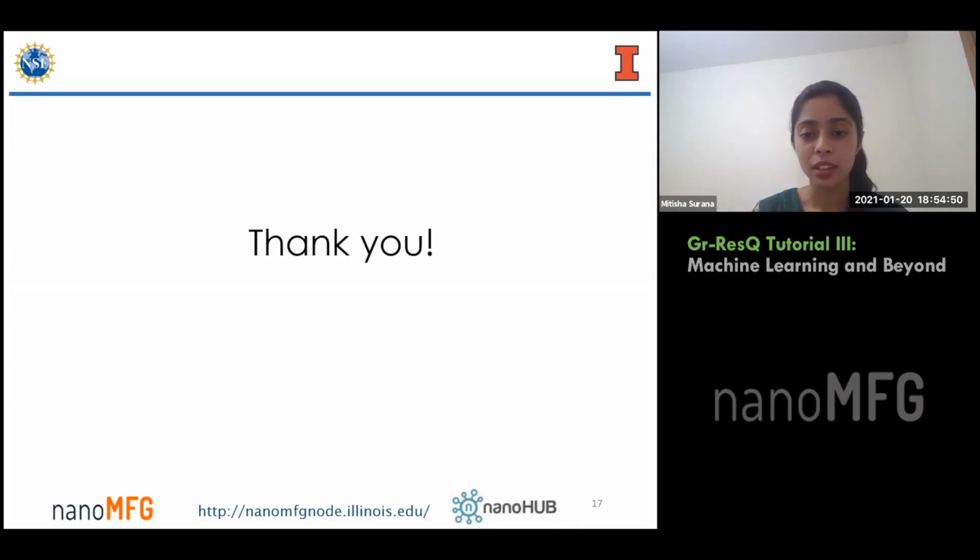As of now, we have not actually data mined on recipes still. So we are still trying to increase the number of recipes that we have, and then we are going to connect the results of the SEM images as well as Raman, and then find parameters that are important and move forward with that. But as of now, we haven't done data mining on just recipes. Our main focus is on the image tool and Raman tool, and automating the Raman tool as well.